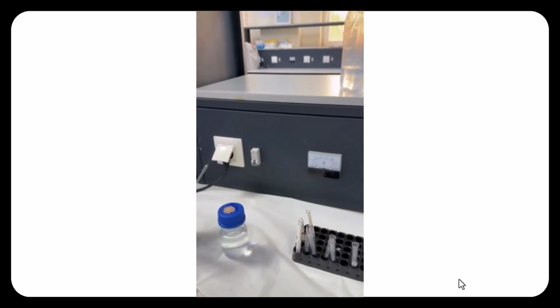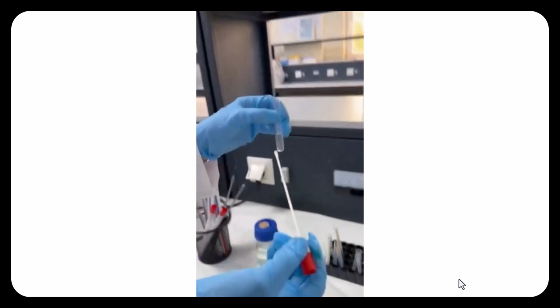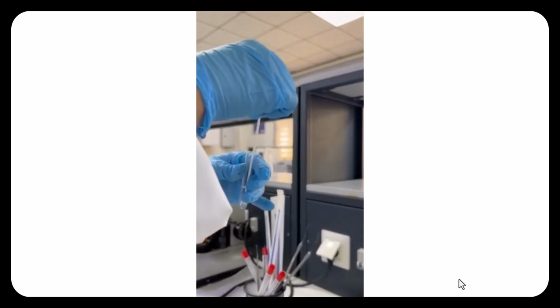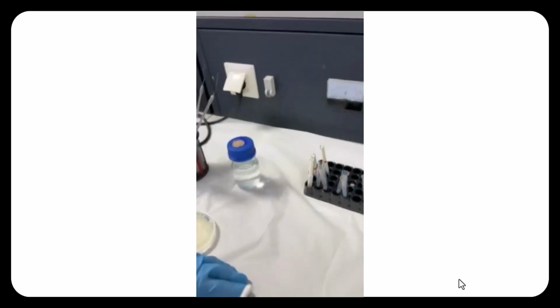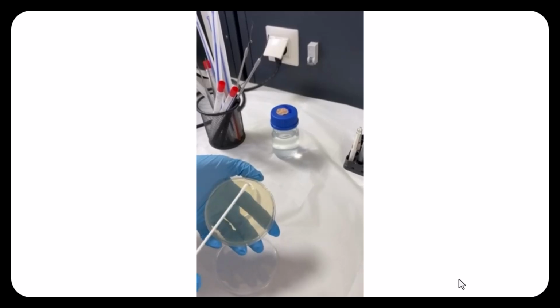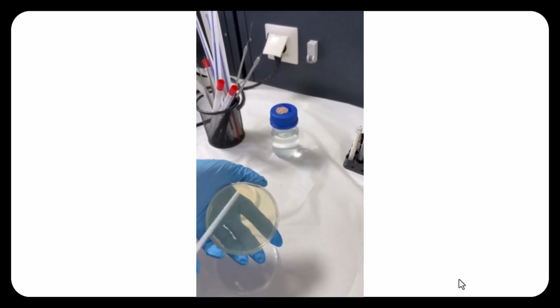After preparing the 0.5 suspension of the bacteria, using a sterile swab, we put it in the suspension of the bacteria and make the spreading on the Muller-Hinton agar plate.